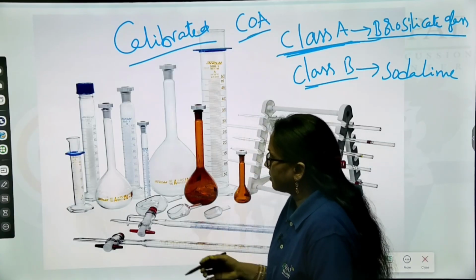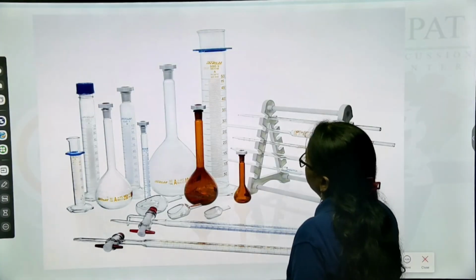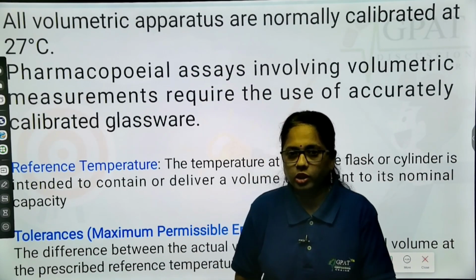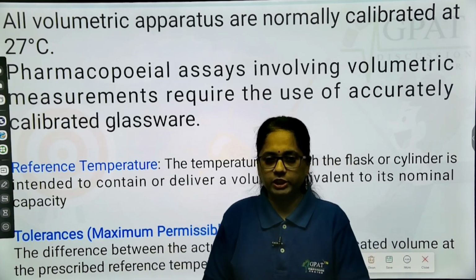So let us see, in order to proceed for the calibration, what we require. Whenever we are in the different climatic zones, okay, zone 1, zone 2, zone 3, zone 4, the world has been entirely divided into 4 zones.